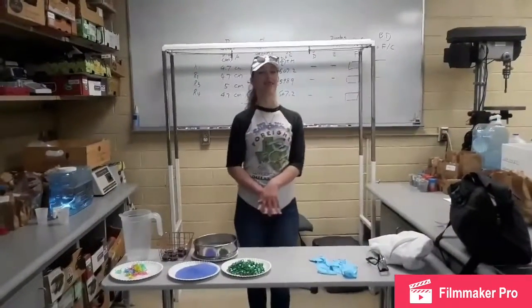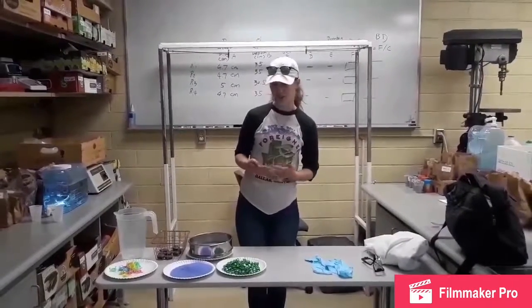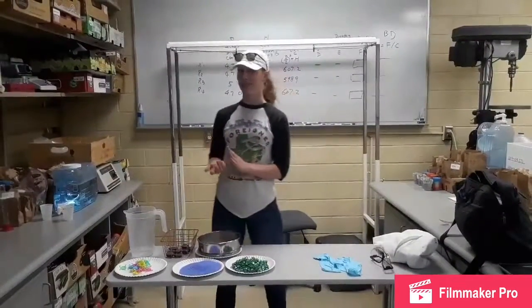Hello, my name is Cherokee and today my lab partner Sarah and I will be demonstrating an experiment of separation of mixtures both by size and by density.